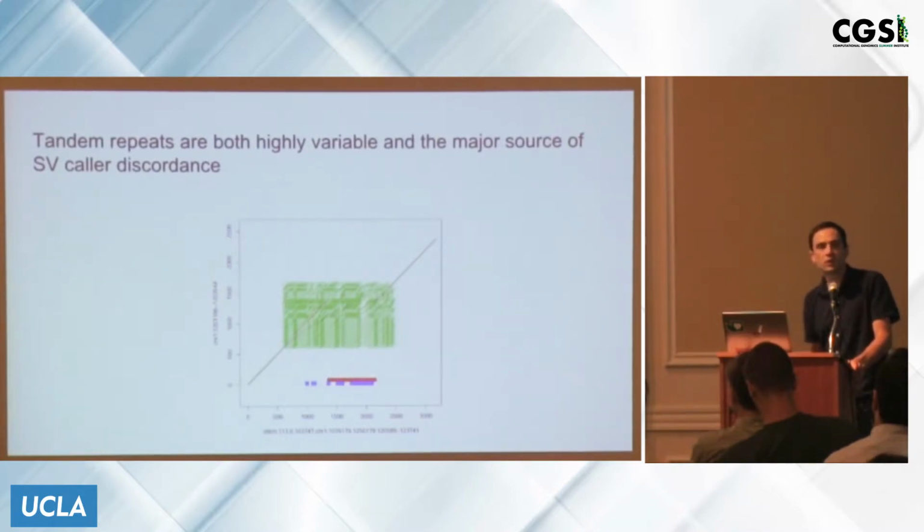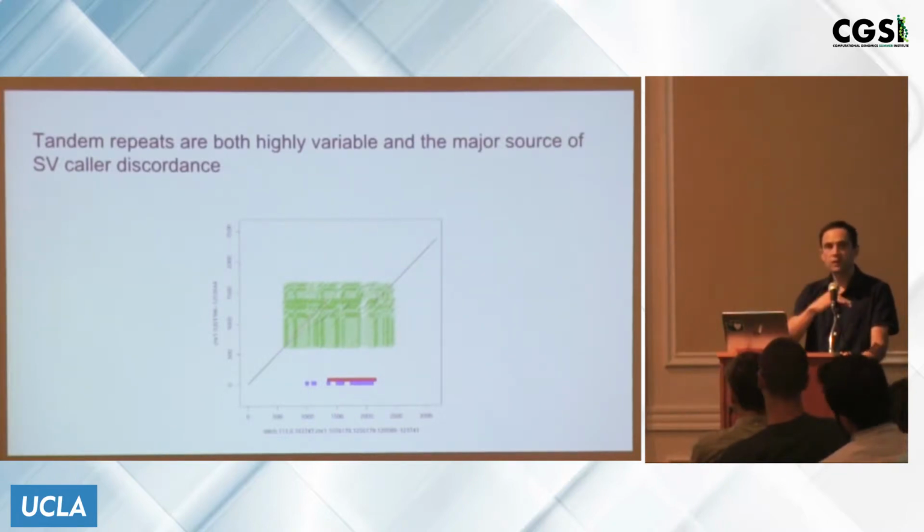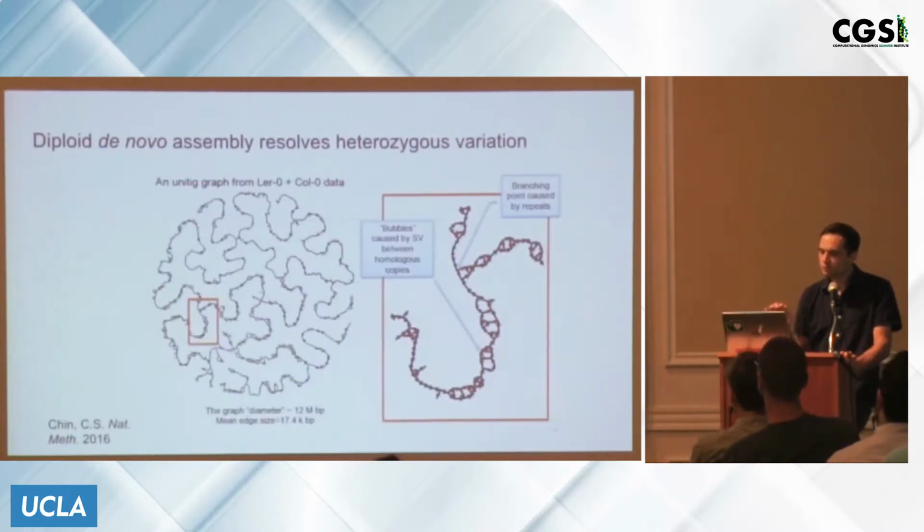So it's an ongoing study to try and determine the best way to go about finding the alignment within tandem repeat regions. Ron Schmier actually just recently published a paper that has an edit distance that's based on duplications and deletions between sequences, and that's probably going to be the best way to define it. That was in the context of cancer studies, but you can also apply it in this particular case, but that's ongoing research.